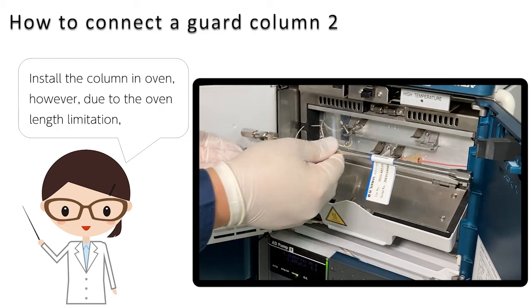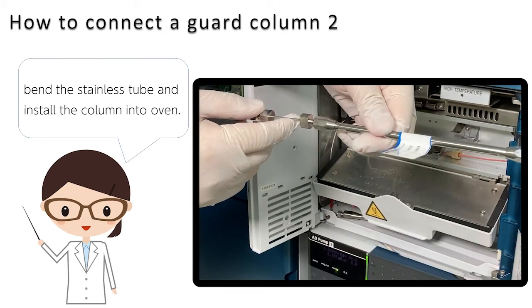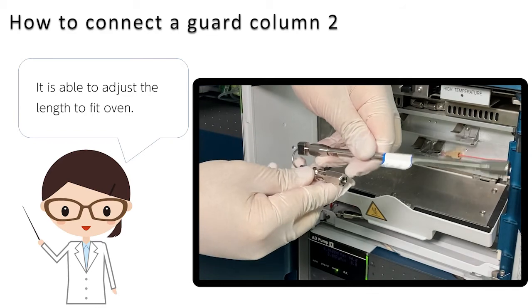Install the column in the oven. However, due to oven length limitations, bend the stainless tube and install the column into the oven. It is able to adjust the length to fit the oven.